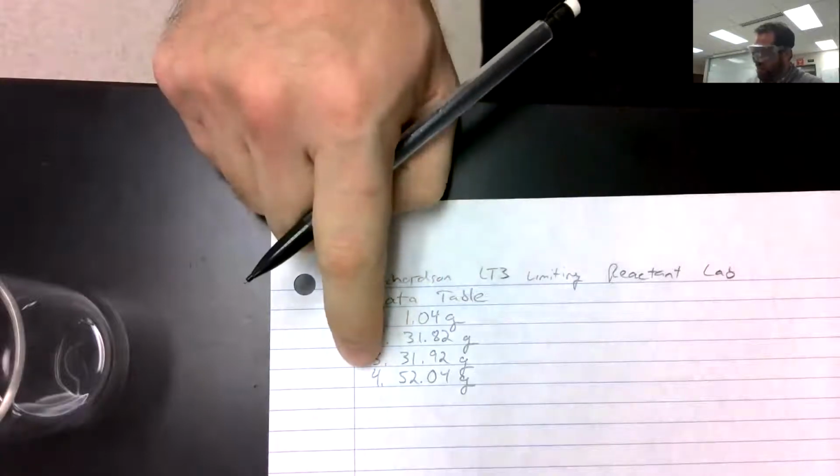That's data point number 4. And perhaps it will be helpful for us to record what we're doing here. So this is the filter paper, a lot of numbers. This one here is the empty 50 mil. This one here is the 50 mil plus, what did we put in that one?